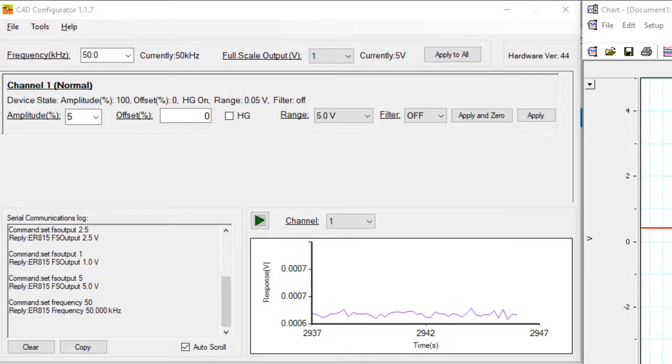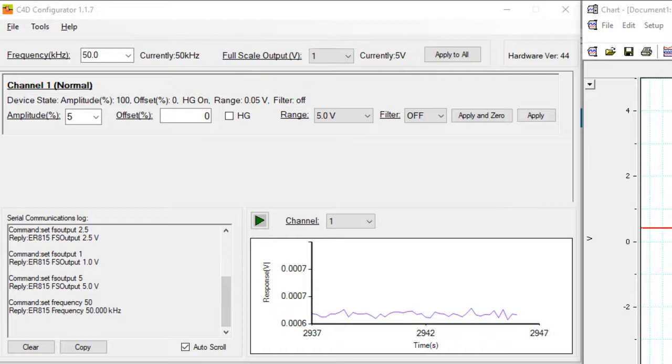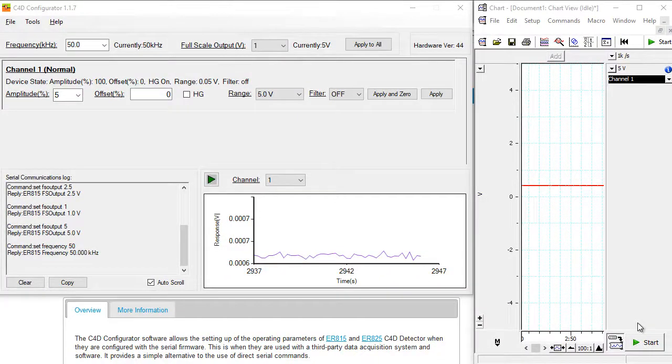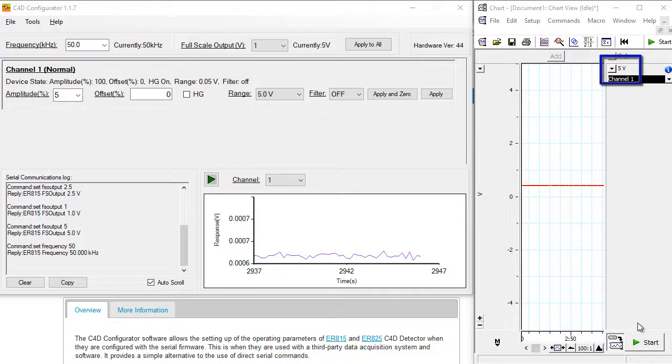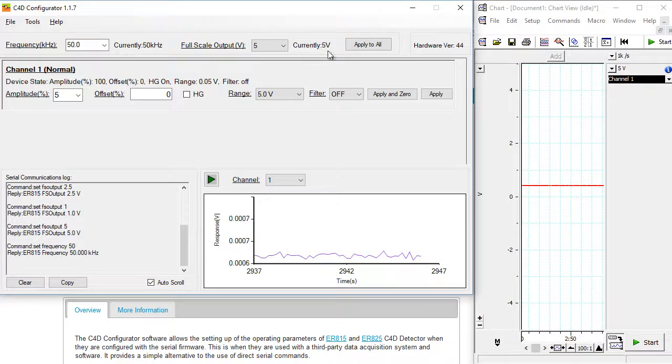You should start by setting the full scale output. The full scale output should be the same as the input of your data acquisition system. So for example here, I have Chart software. At the moment it's set to recording 5 volts, so the full scale output should be set to 5 volts, and click apply to all.